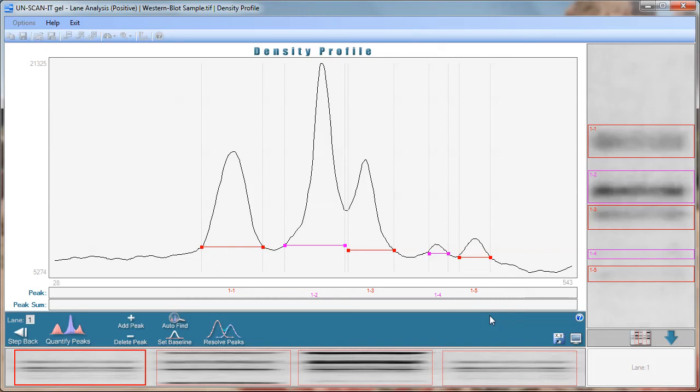The UnscanitGel software will attempt to automatically identify the peaks in the density profile which are associated with each band in the lane. Peak baselines can be added or deleted using the buttons located at the bottom of the density profile.